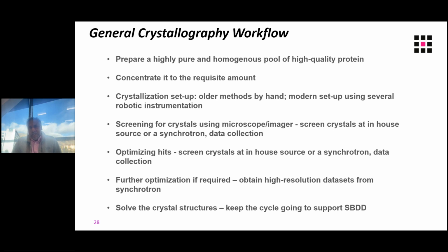Of course, integral to finding hits is also optimizing the hits, and we would today in the present scenario use some of these robotic instruments as opposed to just using manual methodologies. Following successful crystallization and optimization, we would need to obtain high resolution data sets and then solve these crystal structures to hopefully keep the cycle of structure-based drug discovery going in the industry. Next slide, please.